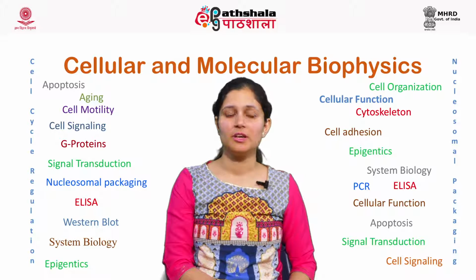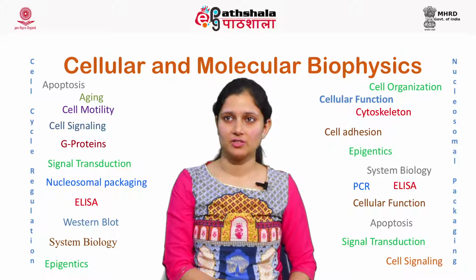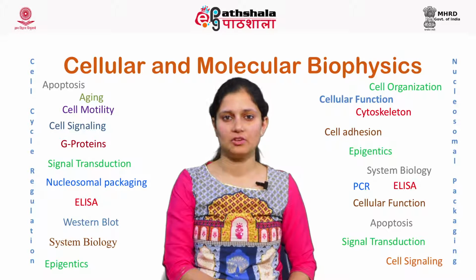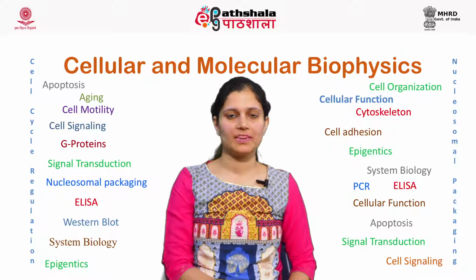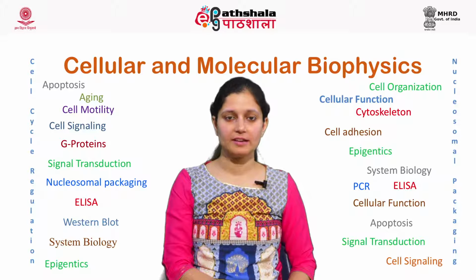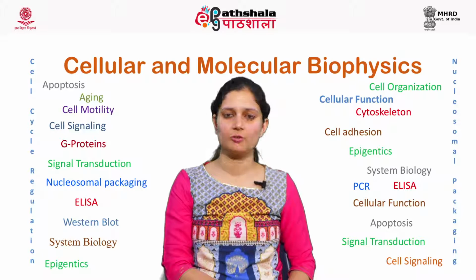In this module, we will be understanding the basic concept of polymerase chain reaction and the 3 steps involved. We will also discuss the instrumentation and different components of polymerase chain reaction or PCR. In addition, we will discuss reverse transcriptase PCR and real-time PCR. Finally, we will enumerate the wide variety of applications of PCR in medical research and diagnosis.